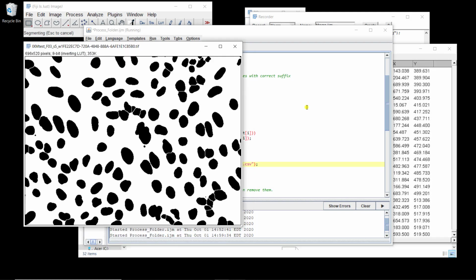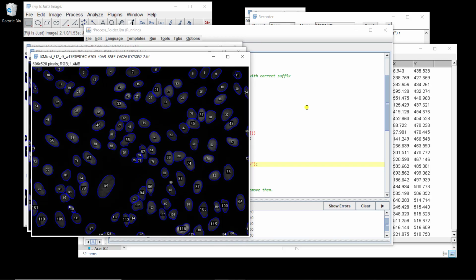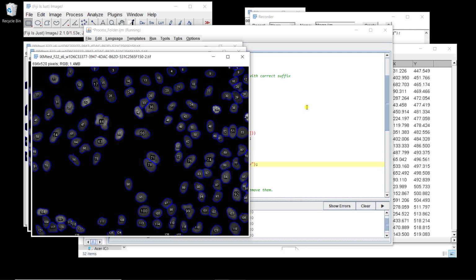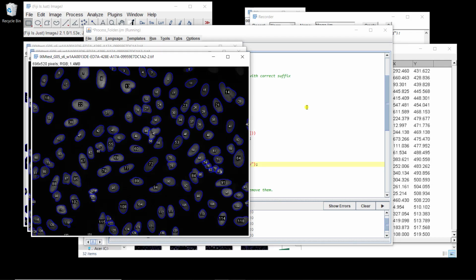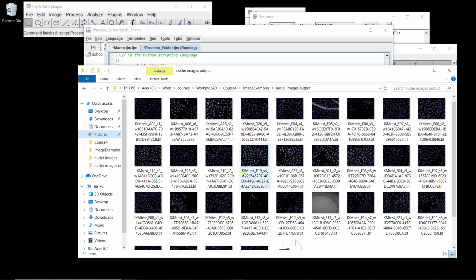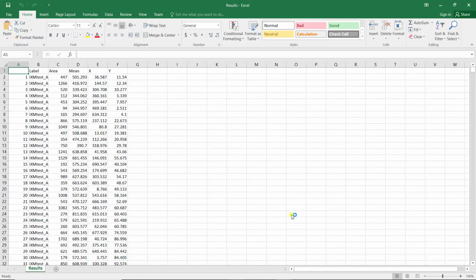And so you make sure that you don't forget, because if you batch process your analysis, you can even batch process the way you save your results, and so you make sure that you don't forget any step. So now if I go in my results, so I use the same name, but I saved it in the right folder, and I saved it with the results, and now I can access them directly.